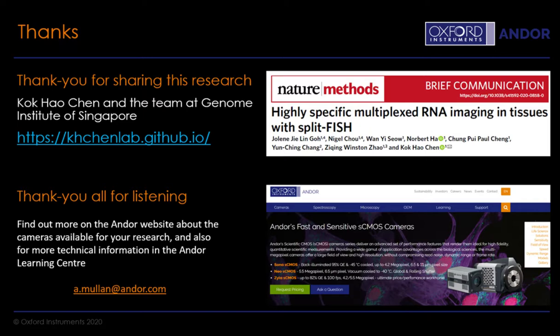Great. It's a very nice question. Perfect. Thank you so much for that answer. So let's move on to our next question. Would adding tissue clearing to this technique provide any further benefit?